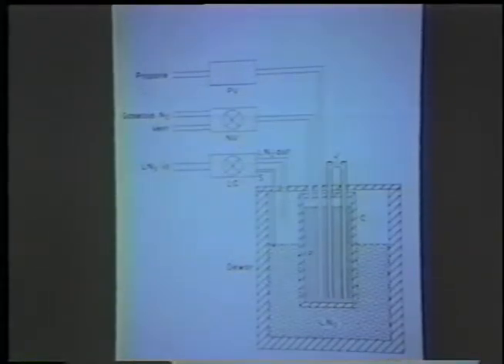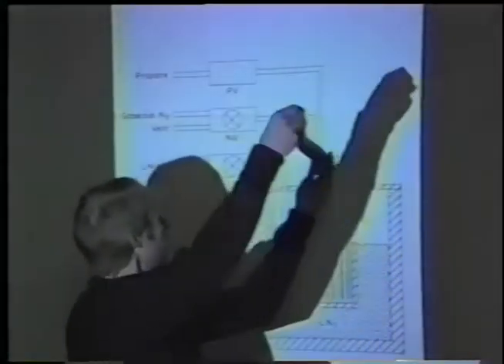Now, where's your specimen holder? The specimen holder would be sticking in here like this.